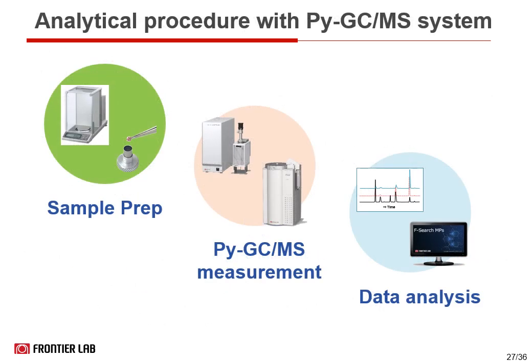Let's talk about the workflow of microplastics analysis by the Py-GCMS system. The workflow is divided into 3 parts: sample prep, Py-GCMS measurement, and data analysis.